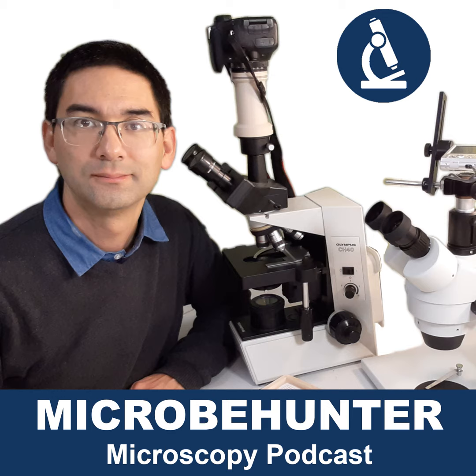Okay, so I hope you already get the point. You cannot say that one is better than the other, obviously. I can just say, think a little bit first about what you want to look at. Yeah, there's another factor, however, that I might want to mention. Stereo microscopes tend to be somewhat cheaper because I guess the demands on the optics are not quite as high. So you can get very good stereo microscopes also for not so much money. Okay, while for compound microscopes you might have to spend a little bit more to get a decent device.